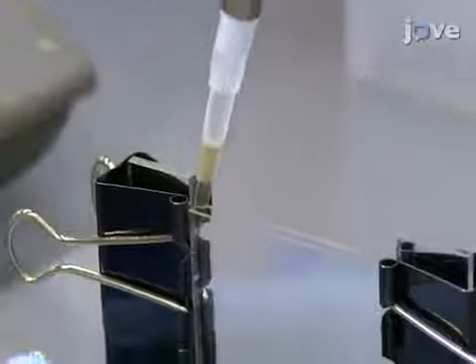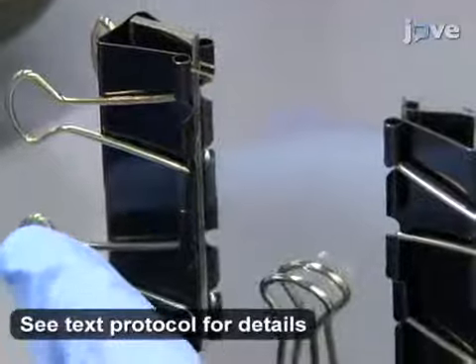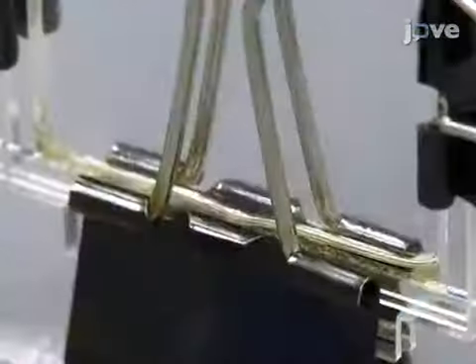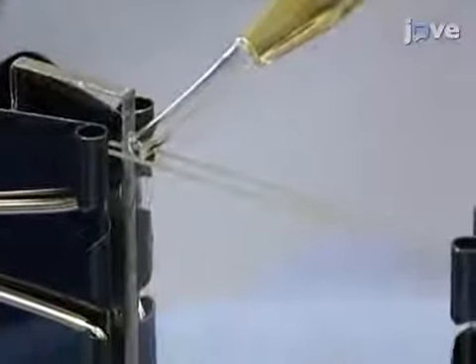Before filling the assembled mold with molten agar, ensure the edges are sealed by pipetting about 70 microliters of molten agar media along the inner side of the mold. Fill the mold without trapping air bubbles inside by slowly pipetting the molten agar along the edge of the mold.